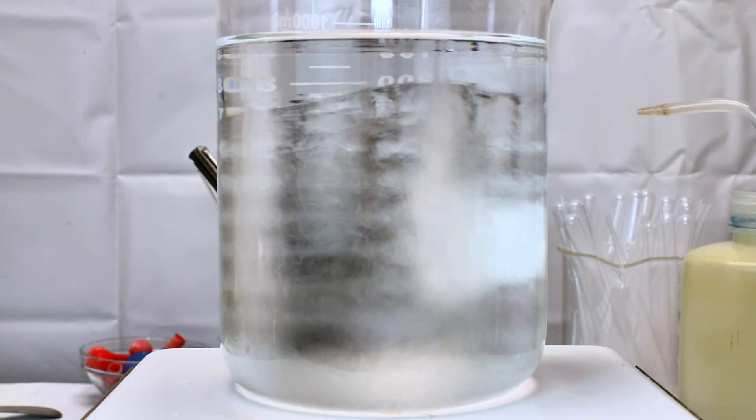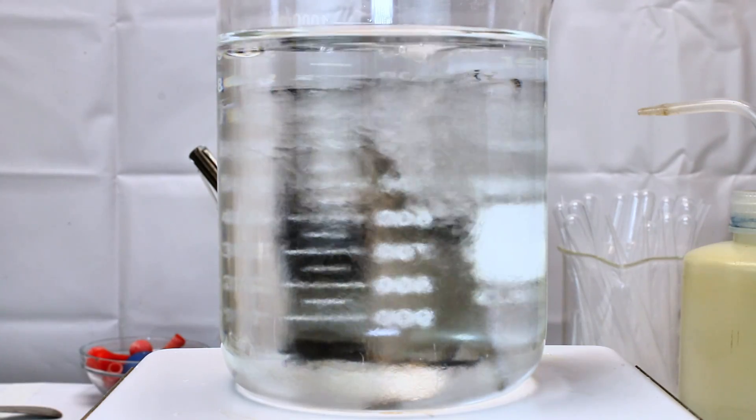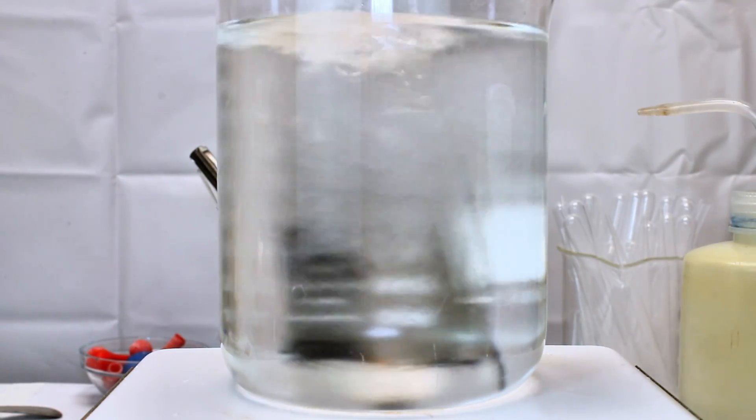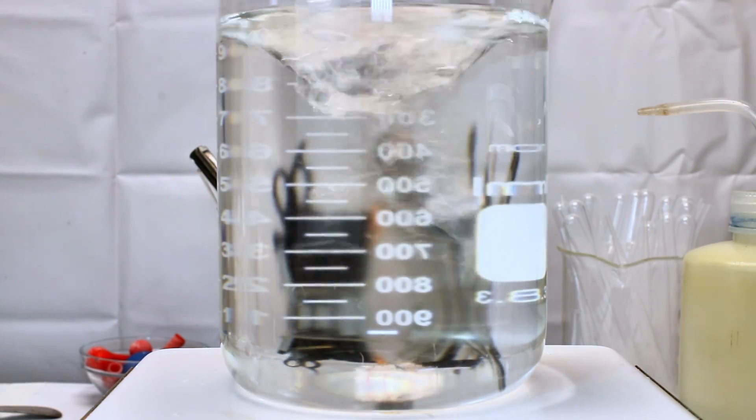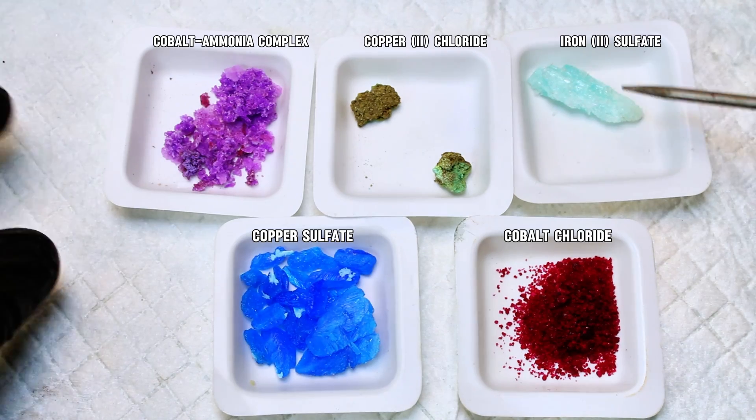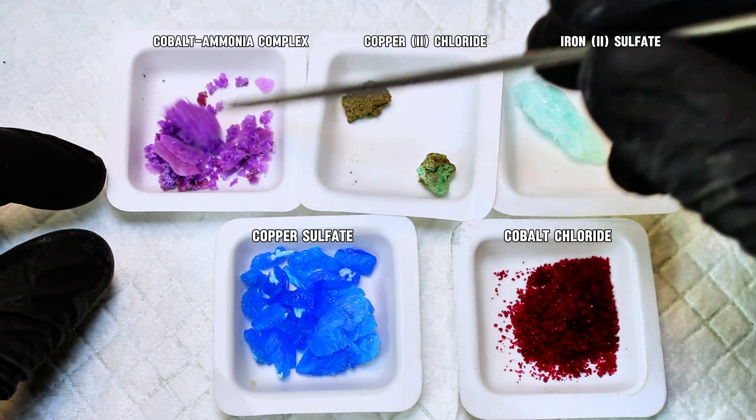For the next step, all you really need are some transition metal salts, and I chose to first try iron sulfate, copper sulfate, copper chloride, cobalt chloride, and tetramine cobalt chloride. Once you've decided what salts you're going to use, all you have to do is select a few crystals and carefully add them to the dilute solution of sodium silicate.